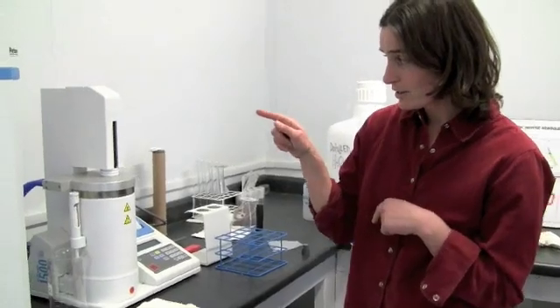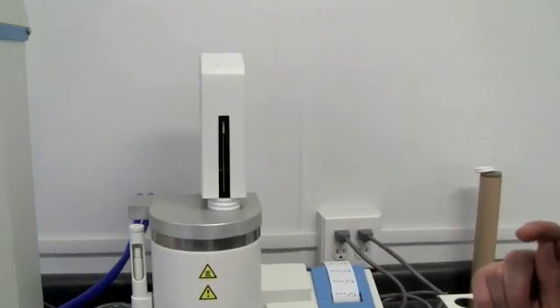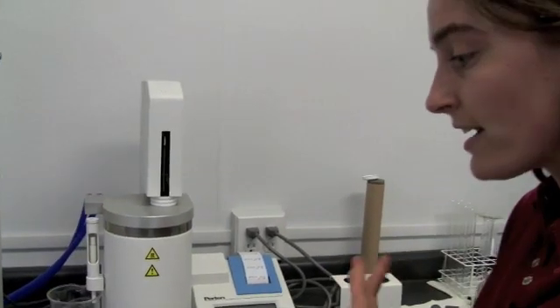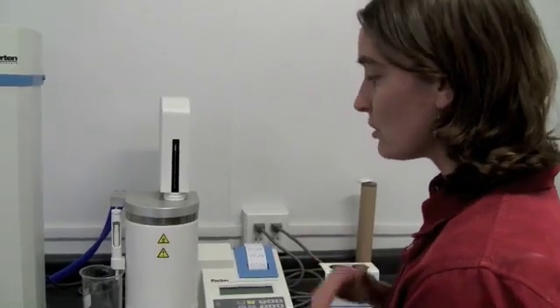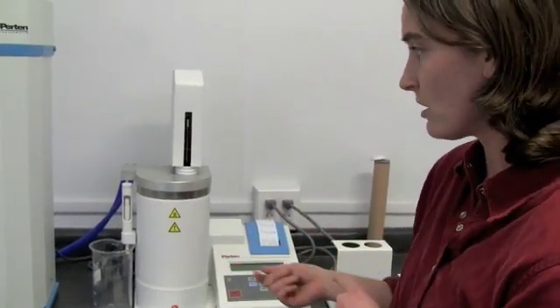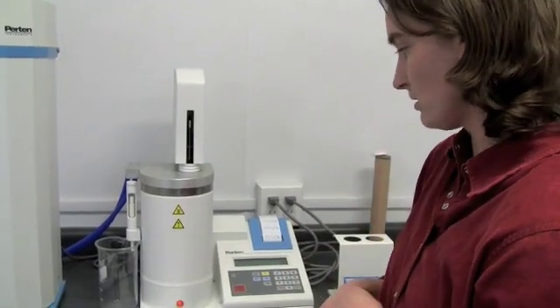The plunger is starting to fall, and we'll see how fast it goes. With high sprout damage, there's a lot of alpha amylase enzyme, and that enzyme breaks down starch. So the more starch is broken down, the thinner this mixture of flour and water is, and the faster the plunger falls.